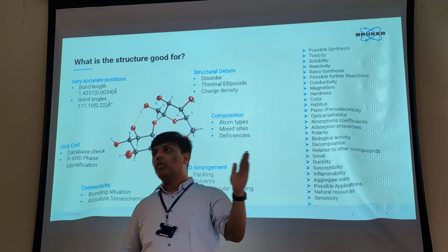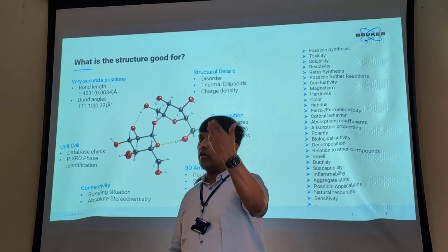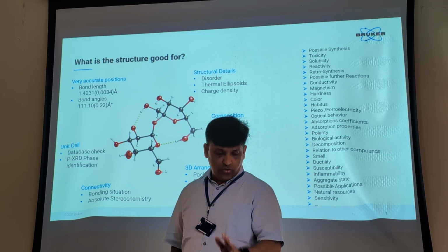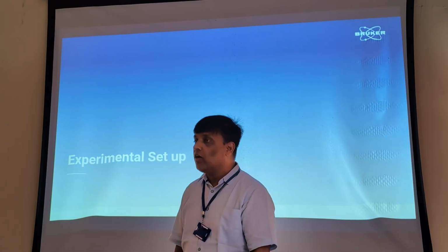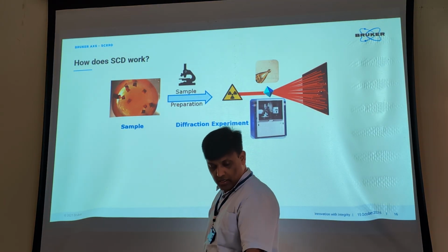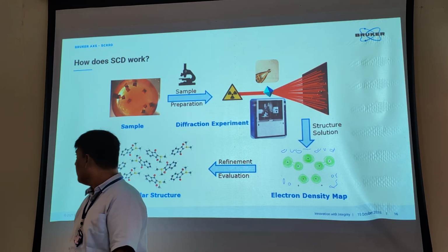Okay, it will tell you about the properties, but then you need to see how the molecules are packing, based on how they are oriented. Based on that, you can say whether it is right-handed, R or S, whatever. Okay, so that's the idea about this instrument. So then, what is the overall procedure of single crystal XRD? This is the workflow of a single crystal diffractometer.